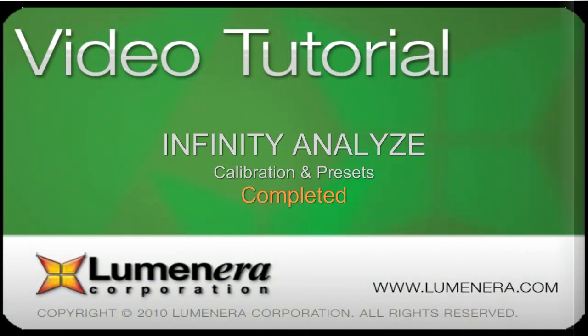That concludes our lesson on calibration and presets. Be sure to check out some of the other videos in the series for details on other camera settings and ANALYZE functions.